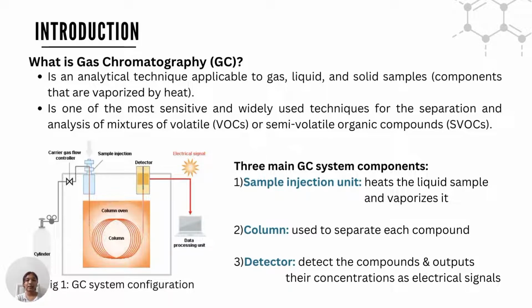But what is gas chromatography? It is basically an analytical technique that is applicable to gas, liquid, and solid samples. It is one of the most sensitive and widely used techniques for the separation and analysis of mixtures of volatile organic compounds and semi-volatile organic compounds.